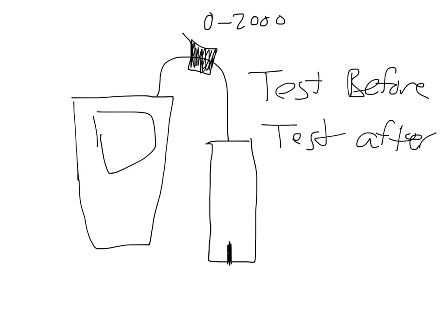Also, for your testing for your glucose, we will not be using the Benedict's test. We're actually going to be using test strips, which run on the same principle, and I may have talked about these in your class. The test strips will turn a certain color depending on whether or not it's positive.